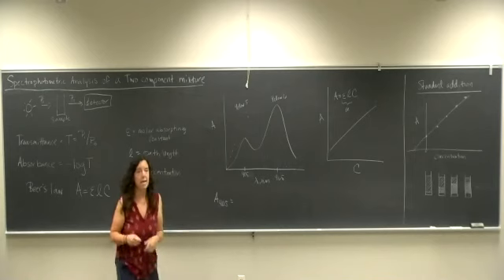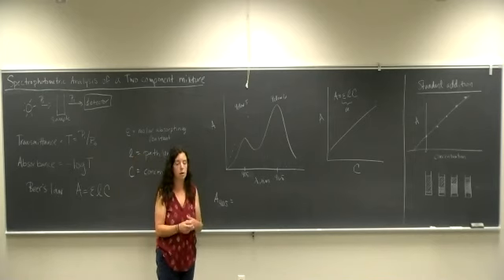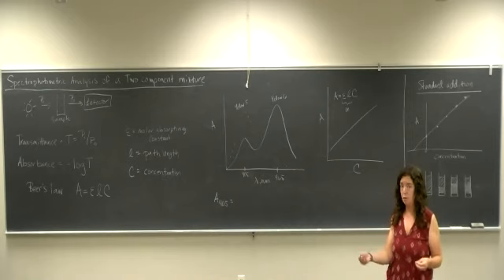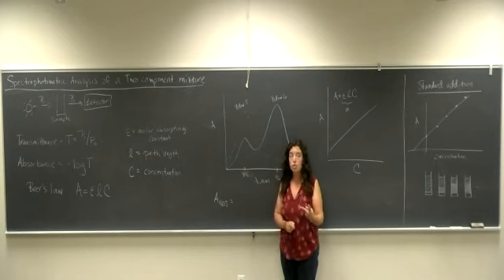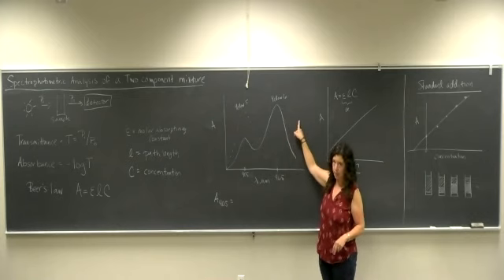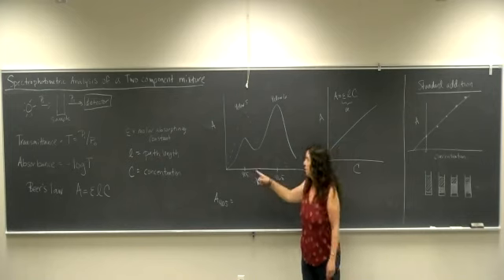So since absorbance is additive, you're going to make the same concentrations that you made in Project 3. Well, you'll make solutions where you'll make known concentrations, and then you'll measure the absorbance. But now you're going to have to make two different calibrations. One for your yellow 5 dye and one for your yellow 6 dye. And then you will make calibrations at two different wavelengths.